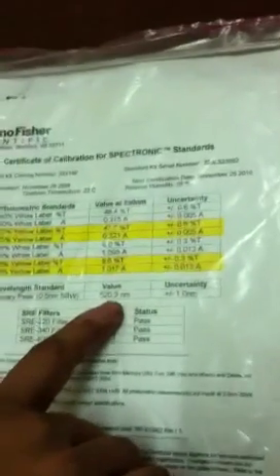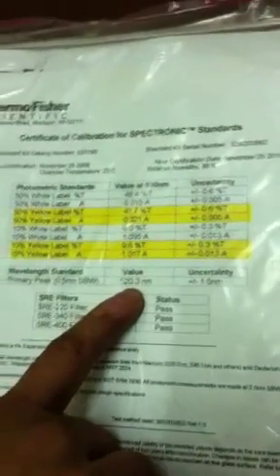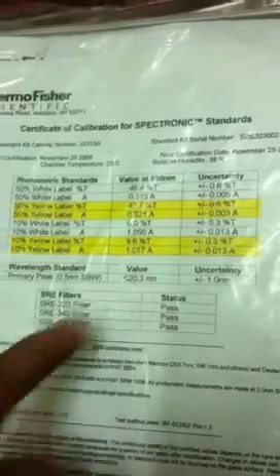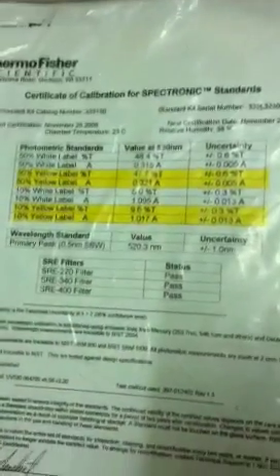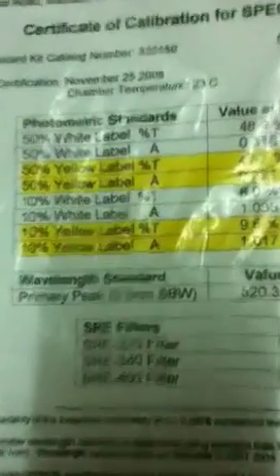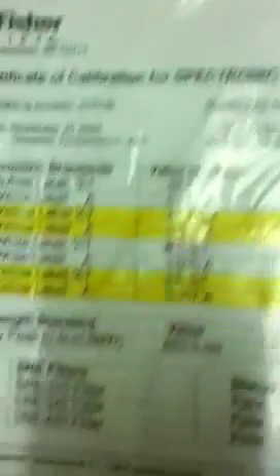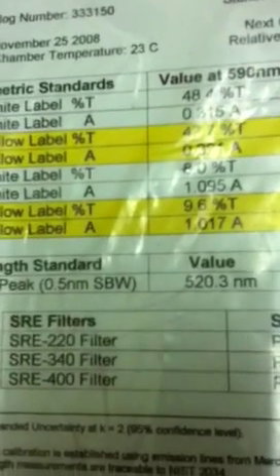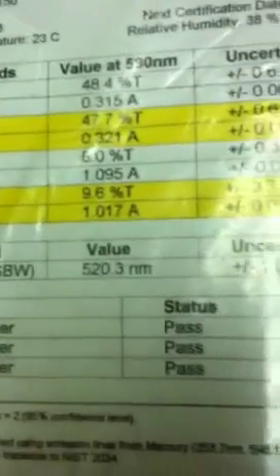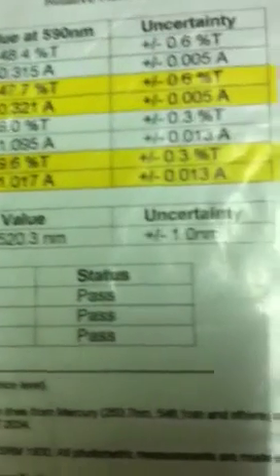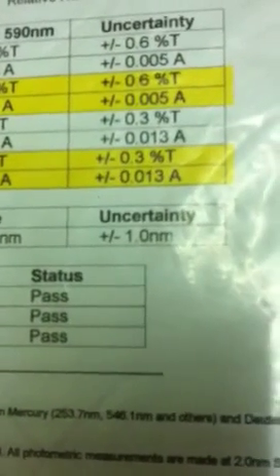Having a certified value which is 520.3 nm which is its primary peak, manufactured by Thermo Fisher Scientific certificate of calibration. Primary peak for this filter is 520.3 plus minus 1 nm, alright.